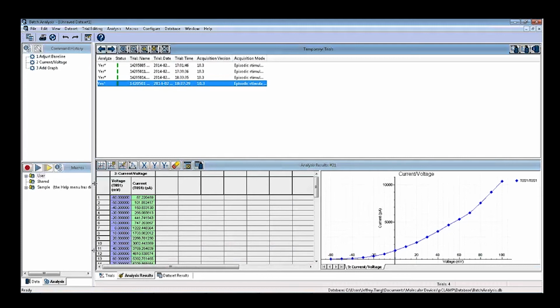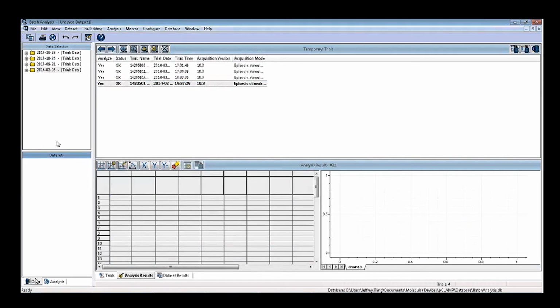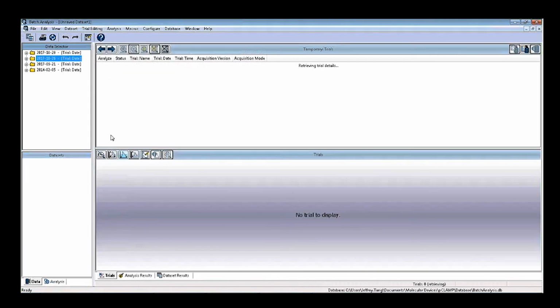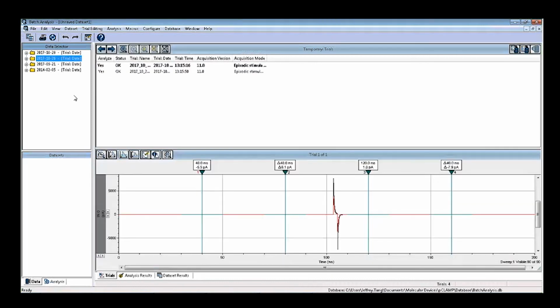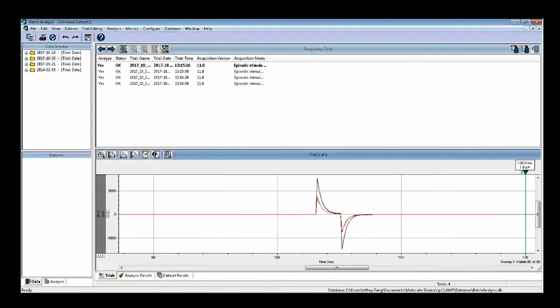Now, let's say I go over to here. I want to measure the peak for you guys. This is the data. I want to measure the peak amplitude. I just bring the cursors, 1 and 2, and then 3 and 4. I want to measure the peak for the 4 data files. Now, at this point, I want to introduce the macro.